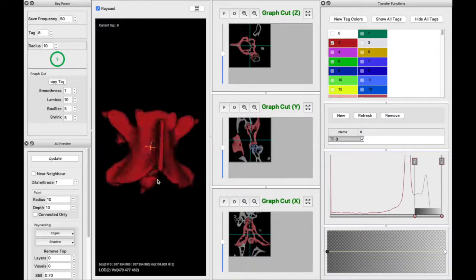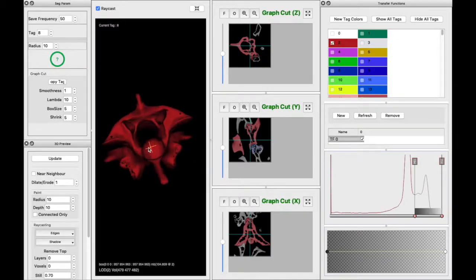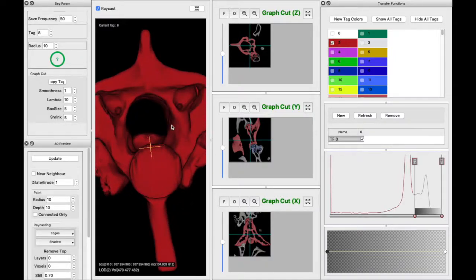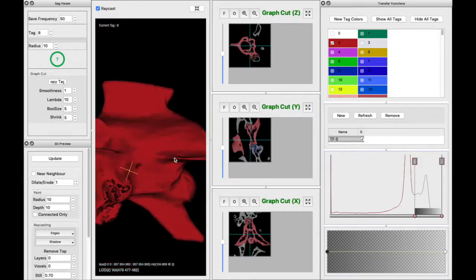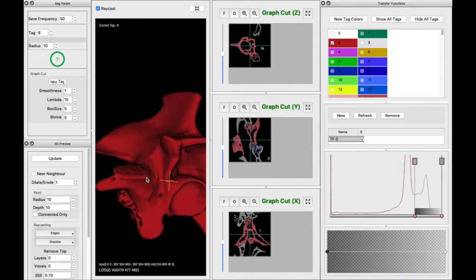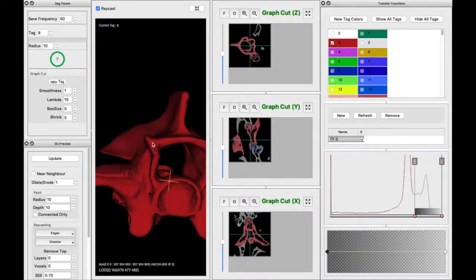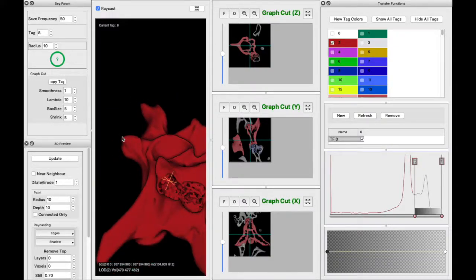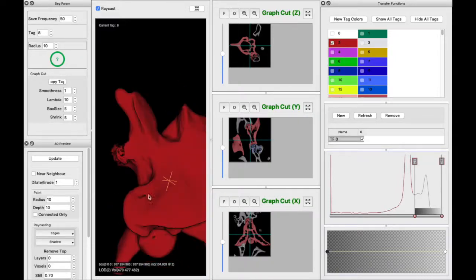One thing that I have always found to make sure the scans are really nice and clean is to go back through not just the condyle area, but everywhere where the vertebrae connect, like right there, we can zoom in and see, look, there's a few slices that we might have accidentally tagged that we could go through and erase just to make it cleaner. There are some lines and excess stuff right there that some 255 could make smoother. And, oh yeah, right there, I remember we caught some of the rib that we didn't need.